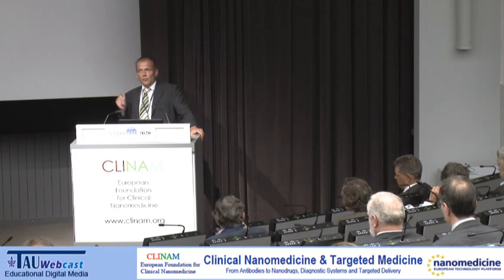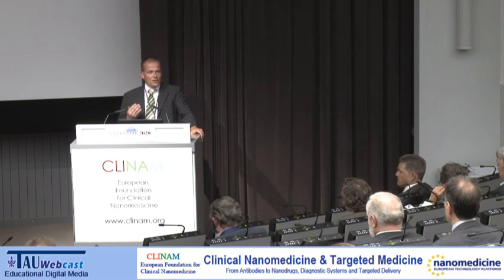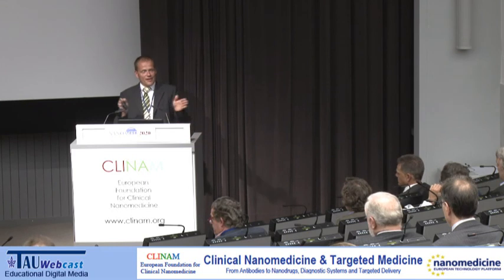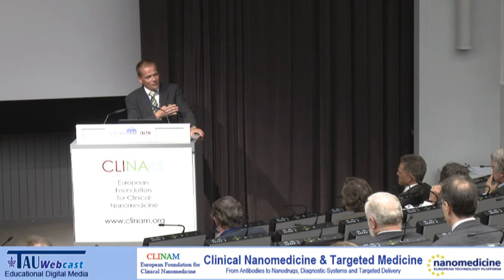Yeah. We always, with the poorly soluble drugs, we typically always use or look at the nano sizing, but then the aim may be a bit different. In some cases, we are also interested in the nano sizing for the human formulation approaches.